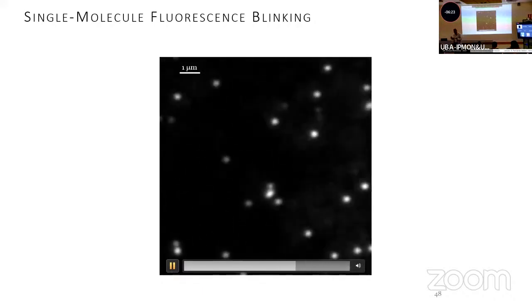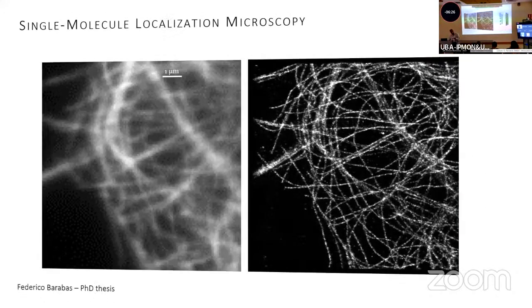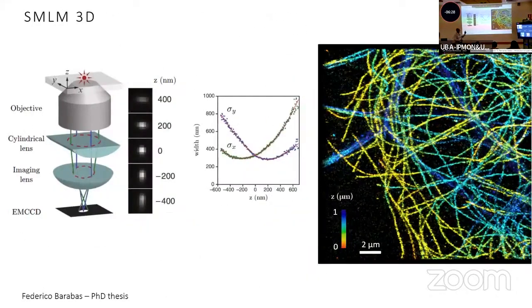But you can do something. For example, if you apply astigmatic imaging, now you're collecting a signal from those 500 to 600 nanometers, but you see that the signals are slightly distorted. Now, when you analyze this, you will not apply any filter for asymmetry, because you want to pay attention to the asymmetry. And that asymmetry will give you the axial position. Some people use more sophisticated PSF algorithms, with more distortions.